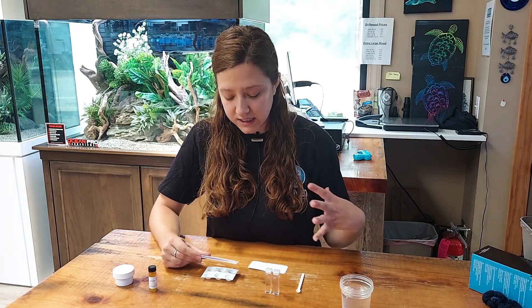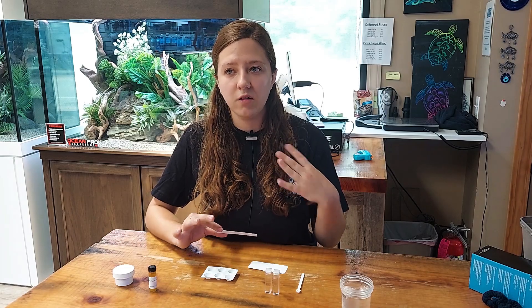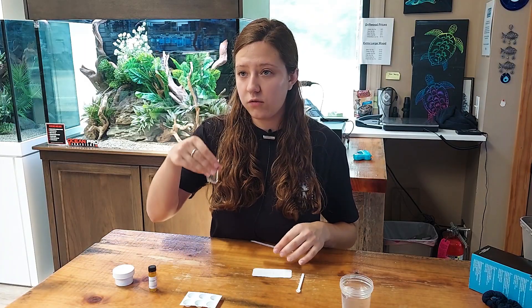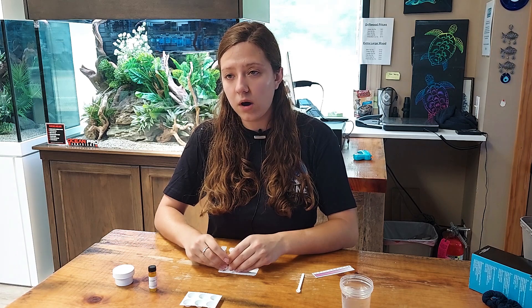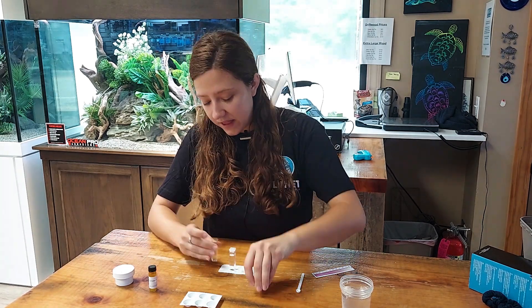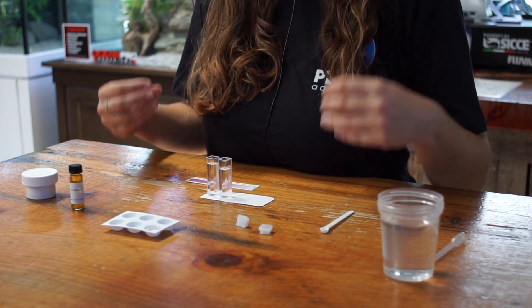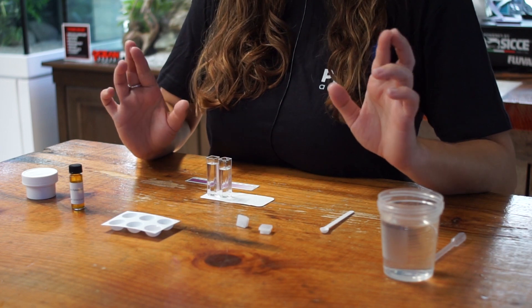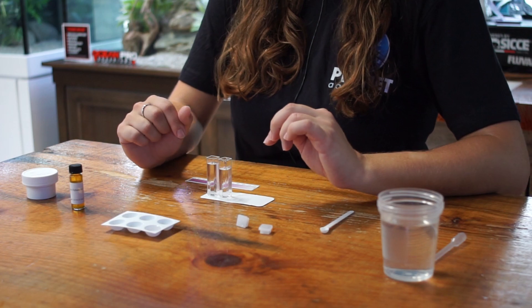Judging by the chart and the hue in our test well, I would determine that the iron levels in our tank are probably going to be between 0.05 and 0.1, maybe a little bit lower — and that is reading the normal range kit. For the low range cuvettes, you want to place them on a solid white surface, remove the lids very carefully, and look from the top down against the white surface, because that will give you the most amount of water to look through to notice the most amount of color difference.